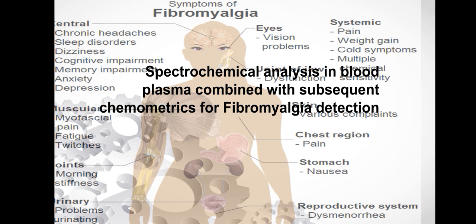So actually these are being employed under spectroscopic study to identify their properties and to diagnose by comparing these properties with those of an affected individual. So this is the technique we are following in spectroscopic pathology or spectroscopic diagnosis.